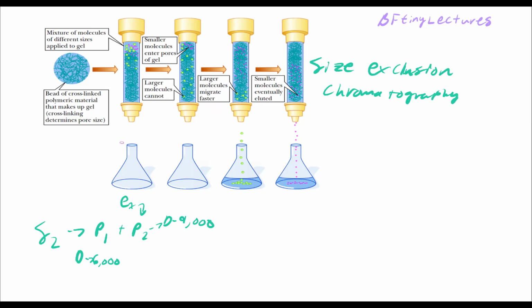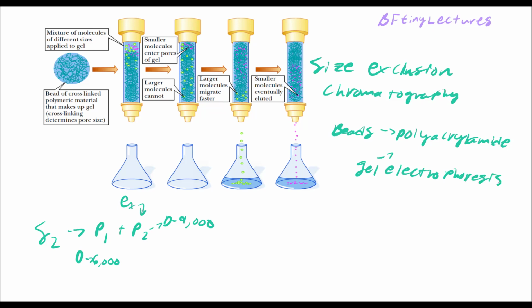And whenever you're working with proteins, the beads are made from acrylamide. So these beads, which are kind of like little jellies, are made from polyacrylamide, and polyacrylamide stops proteins, okay? So it binds with certain proteins, it stops them from moving as fast. It's actually the basis for gel electrophoresis. And we're going to get into that later on in the video. But the lab has these beads made from polyacrylamide.